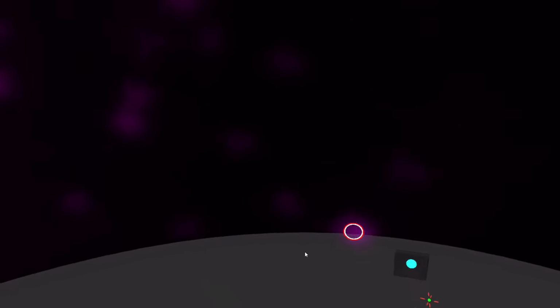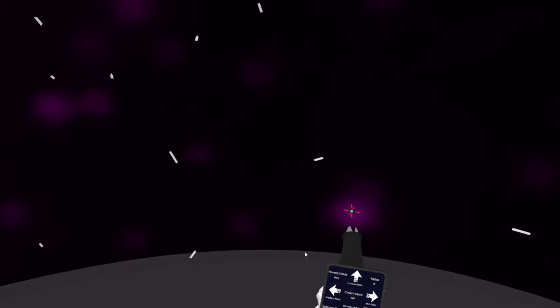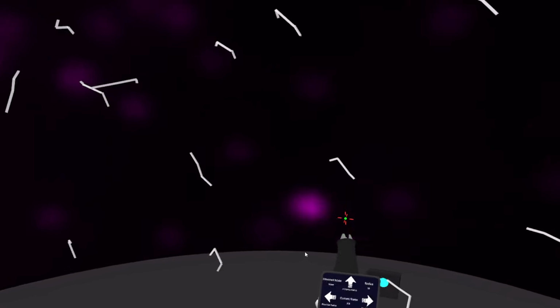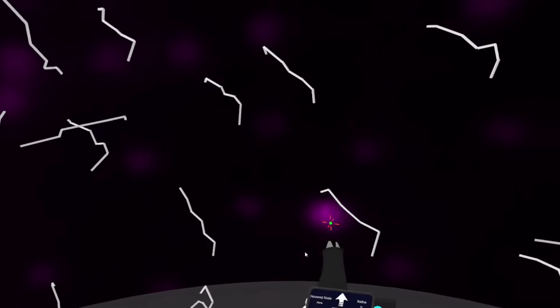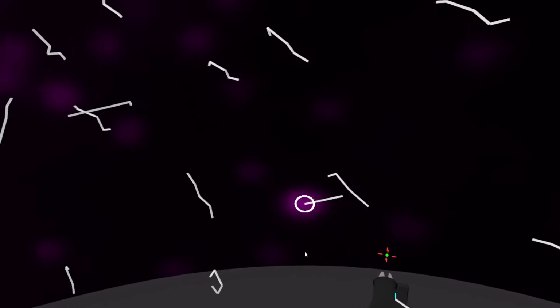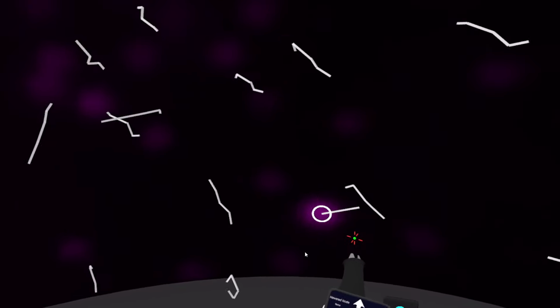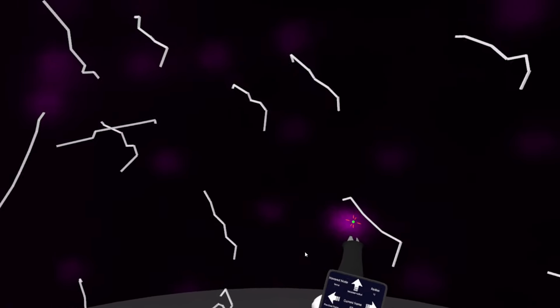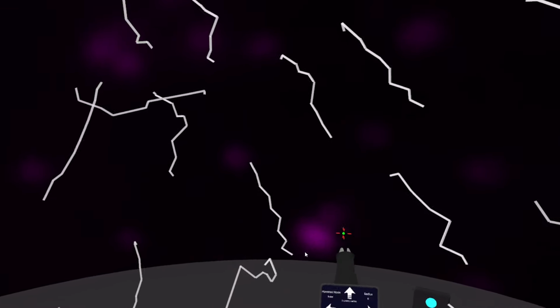So if I click to select it, then I go backward in time and I click on this cell and then this cell and then this cell and this cell. It's going to go back in time and do the tracking for me, right? And it's going to show me my track that I just did, right?